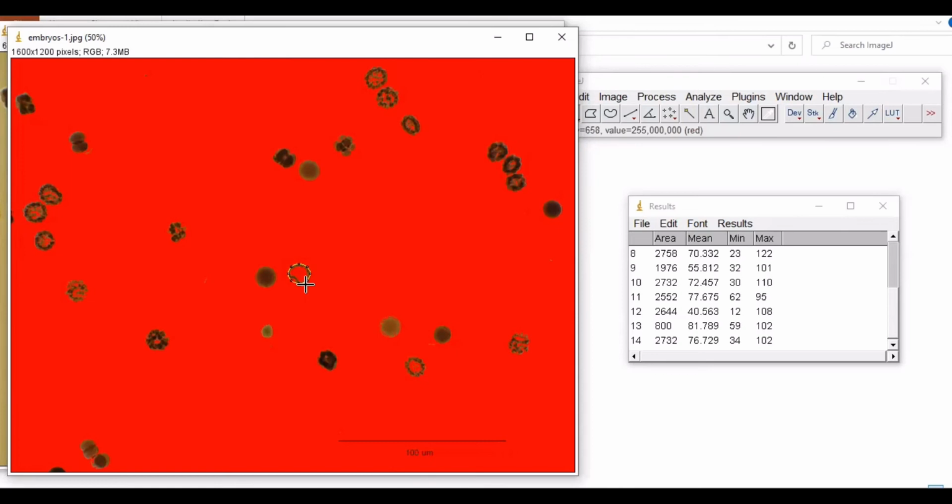Also, in a situation like this where it is not really circle, use this and draw exactly what we're having here, and click on Ctrl M. Here you are seeing the difference.